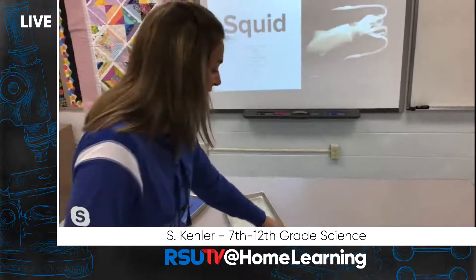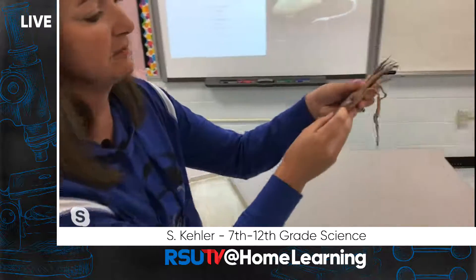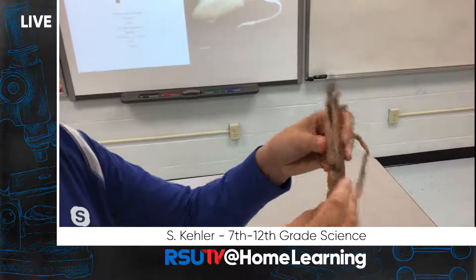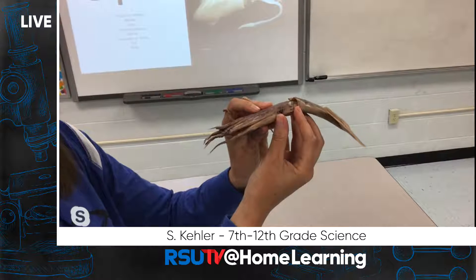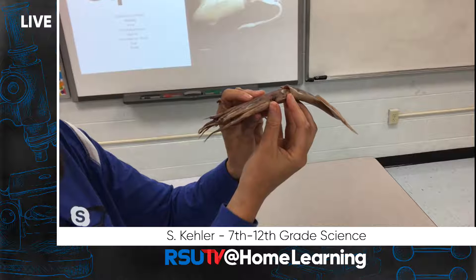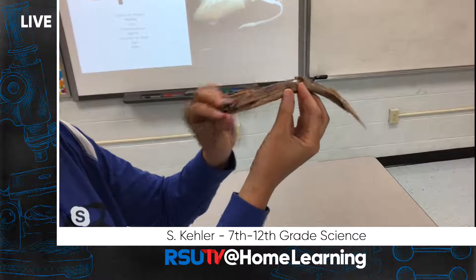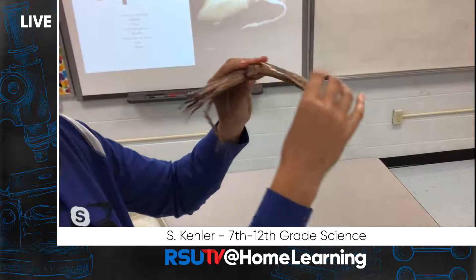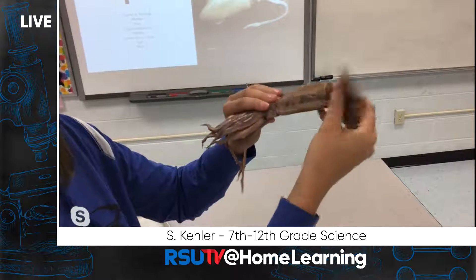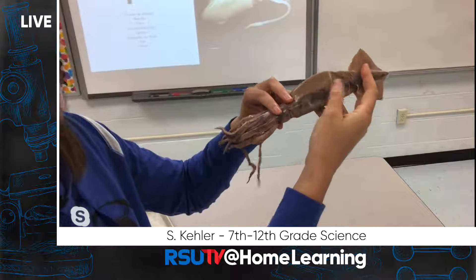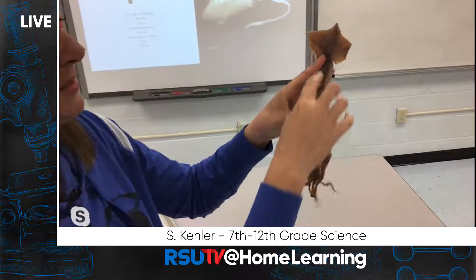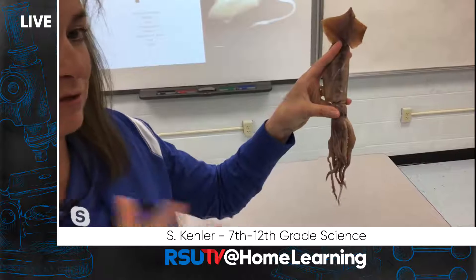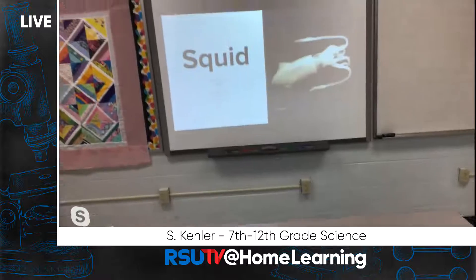This head region makes the squid a cephalopod — cephalo means head and pod means foot, so his head and all his feet are together. This whole other region behind is called the visceral mass, where all his organs are: his stomach, reproductive organs, and gills. My favorite part of the squid is definitely all those chromatophores and watching them flash colors — if you get a chance to see that online, it's really fun.